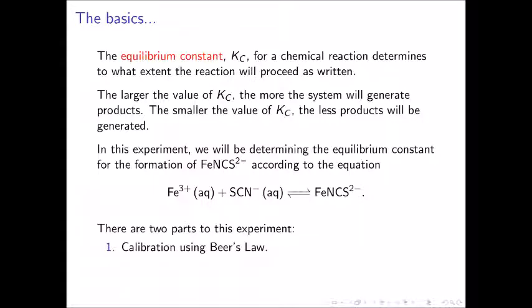There are two parts to this experiment. First, we will be calibrating using Beer's law. Second, we will determine the equilibrium constant from a known set of solutions.